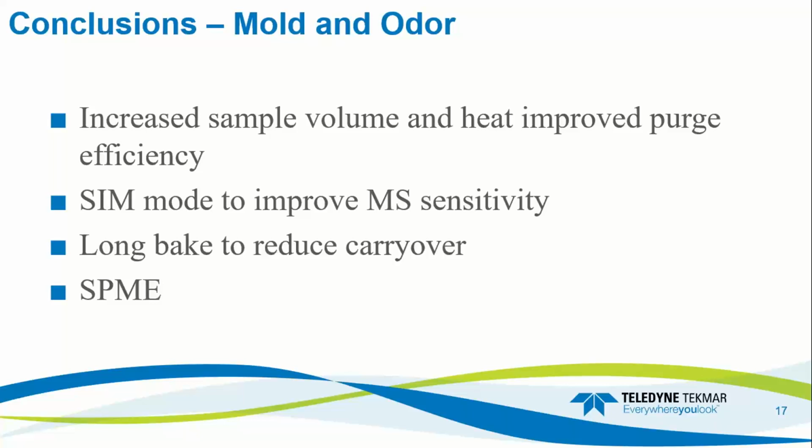So SPME is another common way to analyze mold and odor compounds, and the way this works is a fiber is held in the headspace of a vial while the sample is being heated, and the fiber absorbs the compounds of interest, and then it's placed in the inlet and it's heated, and it desorbs those compounds.